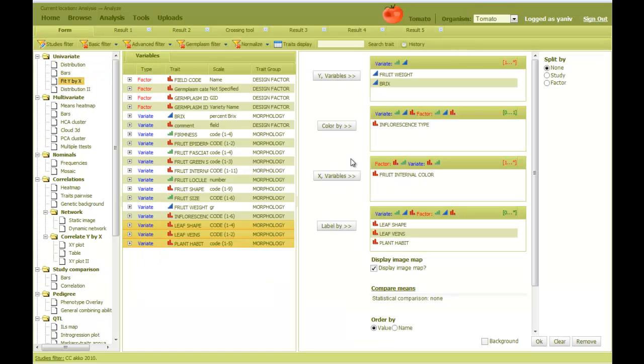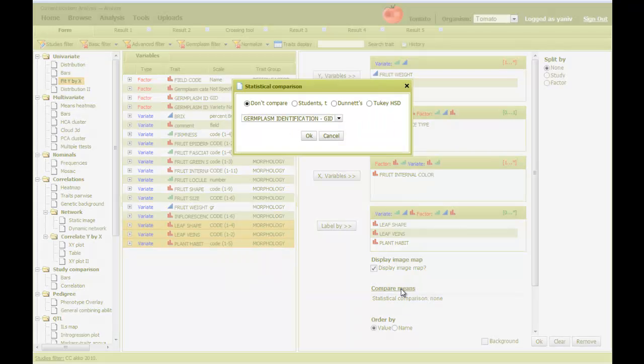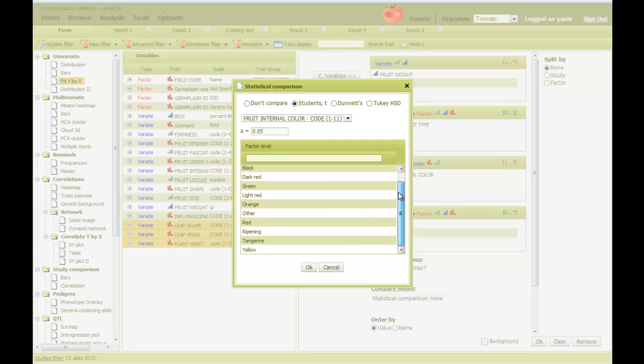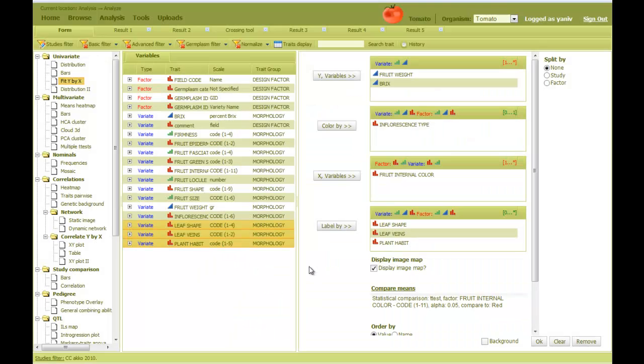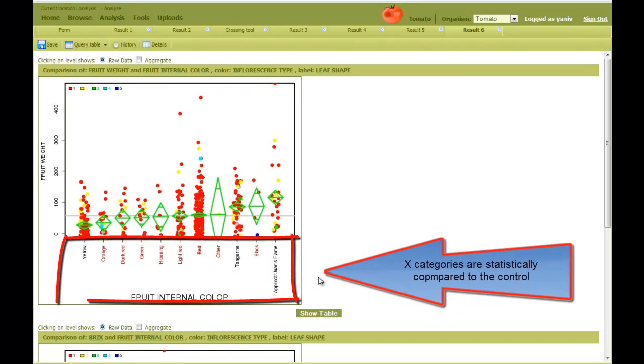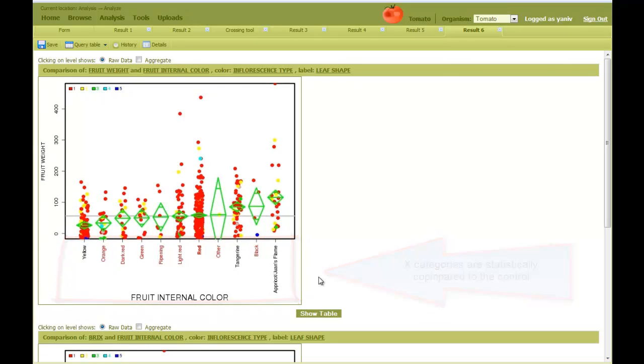I can also perform statistical tests to compare X categories. For this, I click on the compare means, select the type of test I want to perform, set the alpha value if necessary, and then I can select the control category. Let's make it this one. Now the figure shows the results of the statistical comparison. The red category is highlighted. Categories that are colored as black indicate a significant difference compared to the control under the test and significance levels that I have selected.